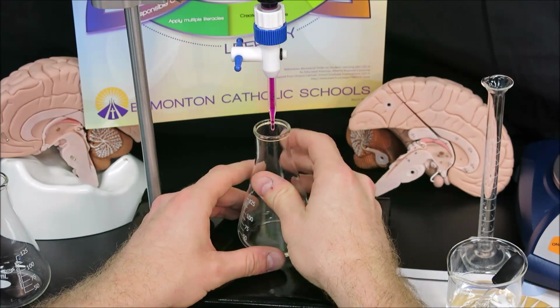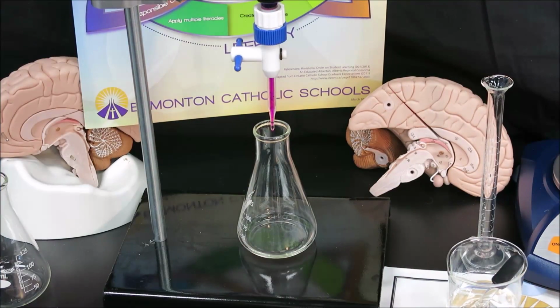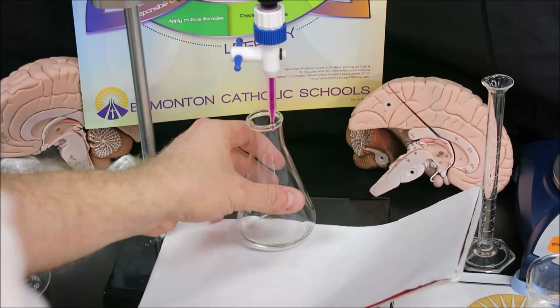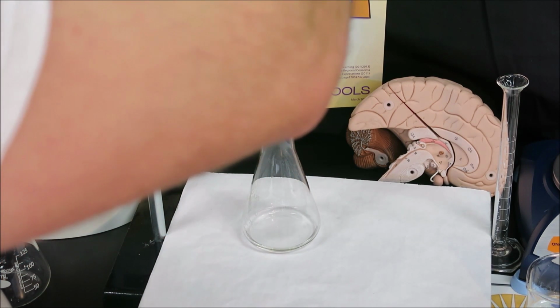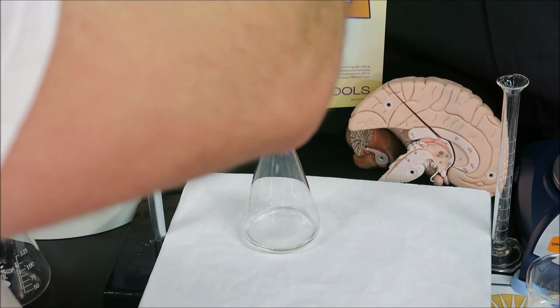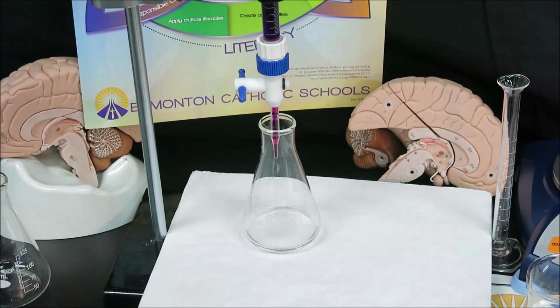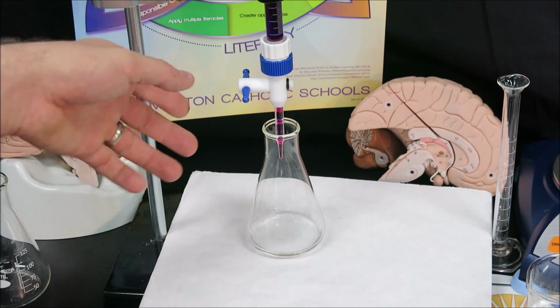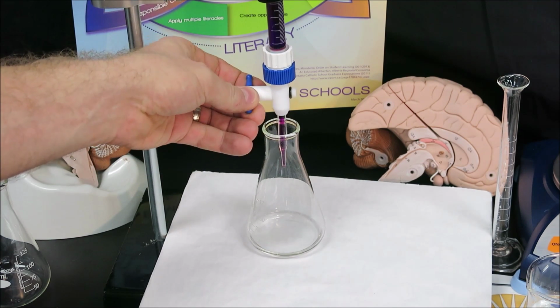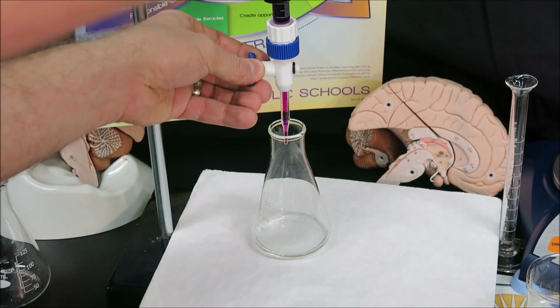Now when titrating, it's very, very important to get the tip past the neck of the Erlenmeyer flask because that's what prevents spilling. It's also important to have a white piece of paper underneath when observing color changes because this color change will go from colorless, what we see here, to a pink color. Not the purple of the permanganate, but a very light shade of pink. And the ideal volume added will finish on a single drop or even a half a drop. You can see if I drip in, now that we've recorded our initial volume of 6.0, a little bit of titrant, it fades immediately.